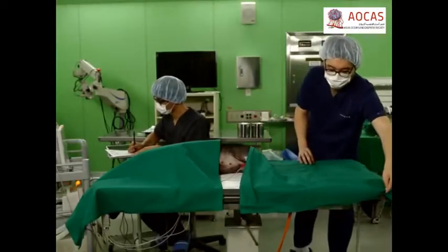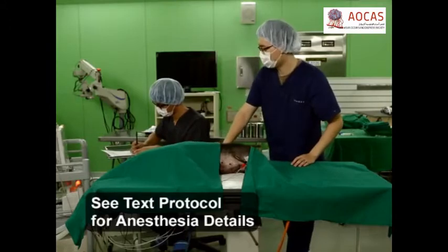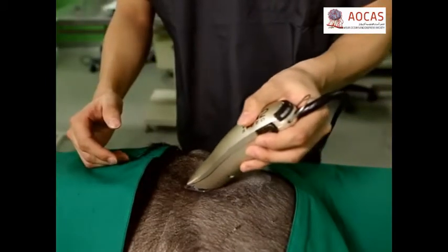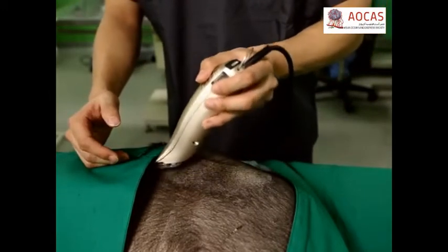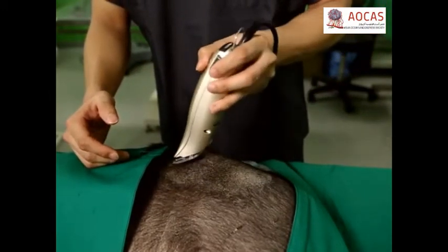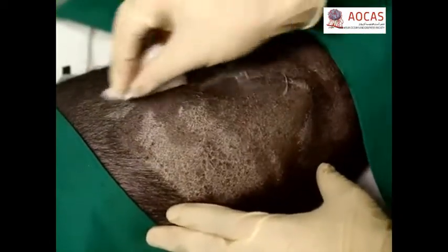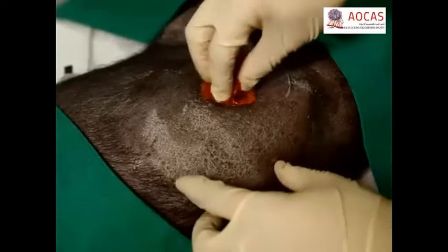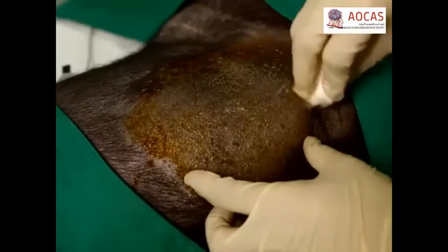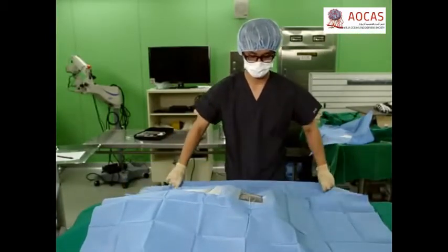To begin, orient an anesthetized mini-pig to access the iliac crest. Next, depilate a 15-square-centimeter region on the iliac crest using a razor or clippers. Then, alternately scrub the exposed skin three times with povidone iodine and 70% ethanol. Once completely dried, apply sterile drapes.